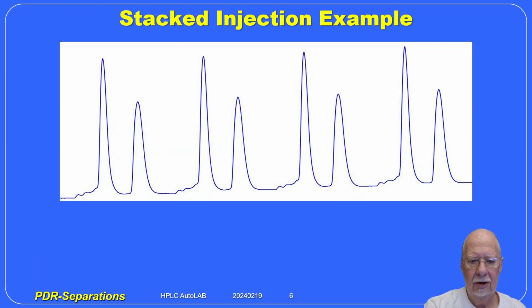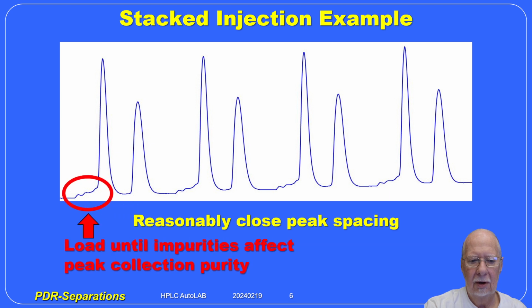Stacked injection example, showing reasonably close peak spacing. Load until impurities affect peak collection purity.